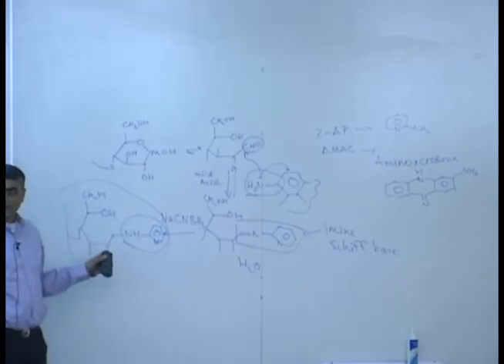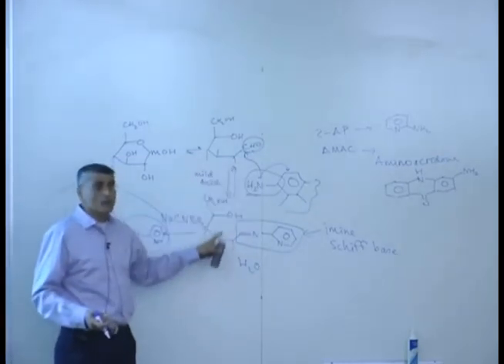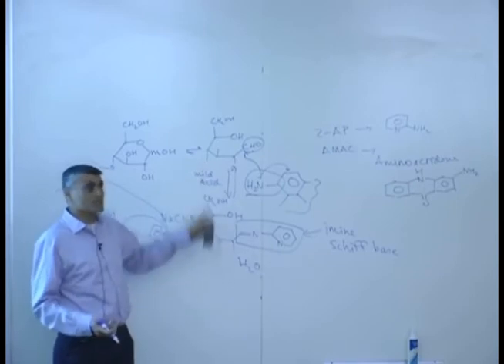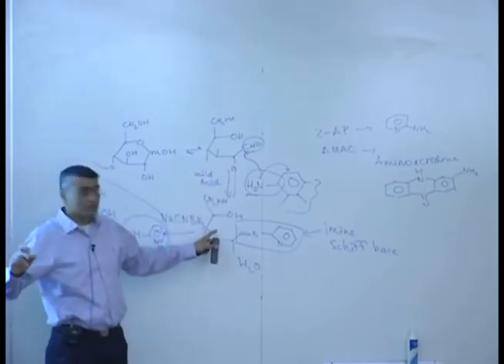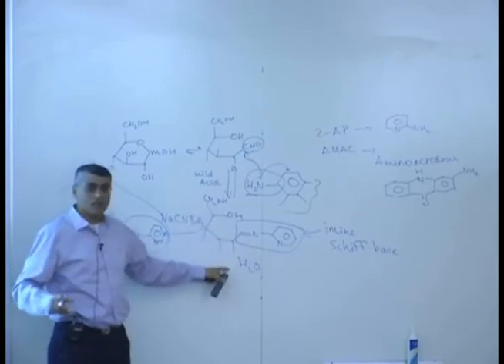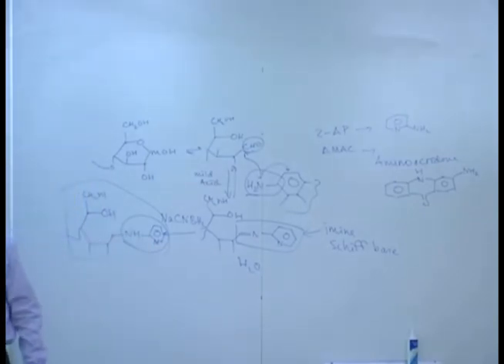However, you might be able to convert it back. If you engineer conditions wherein you allow it to pass through the detector, you detect the molecules, and then you collect the solution and let it hydrolyze, you will get back your glycan for isolation purposes.